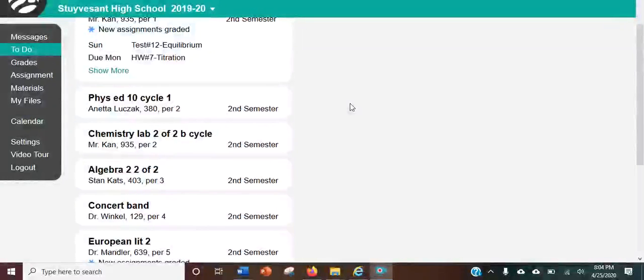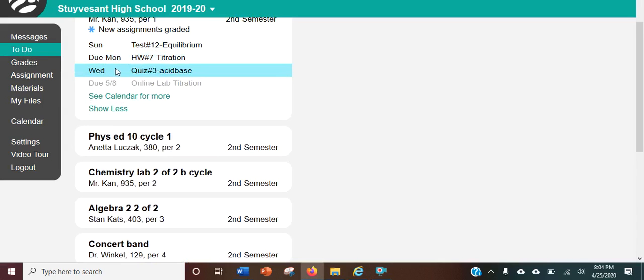In this video lesson, I'll be going over how to do the online lab about titration. Go to Jupyter and click the To Do tab. Once you're there, you're going to go under Chemistry and look for an online lab titration assignment. Once you find it, click it.